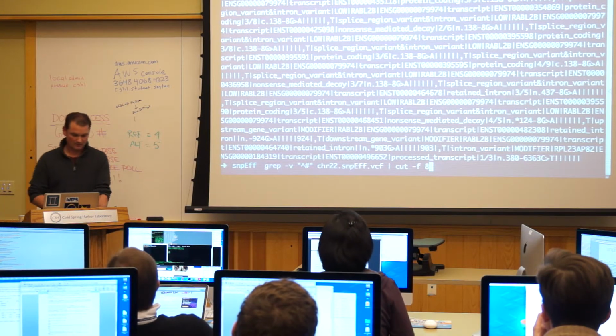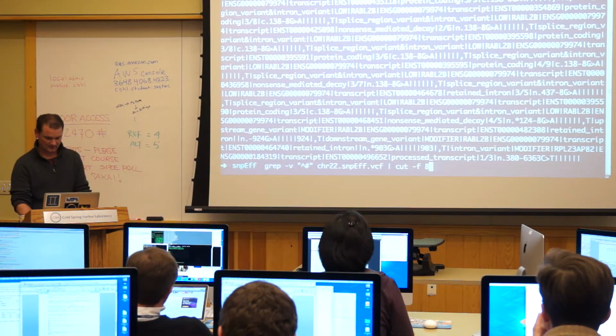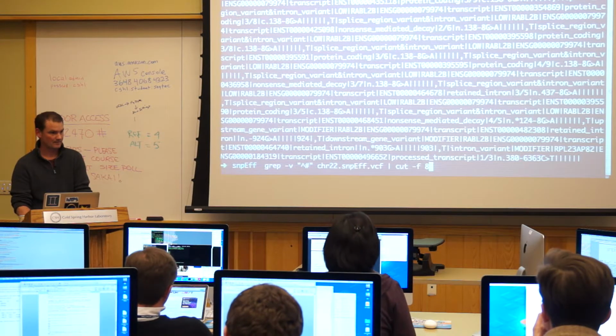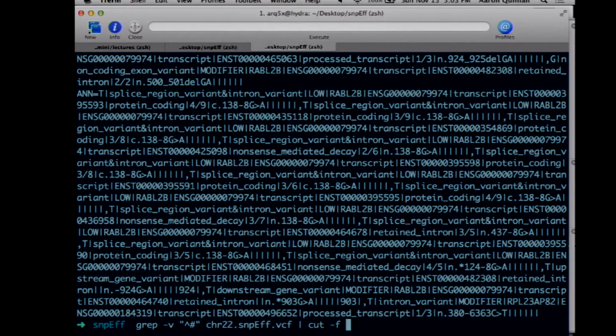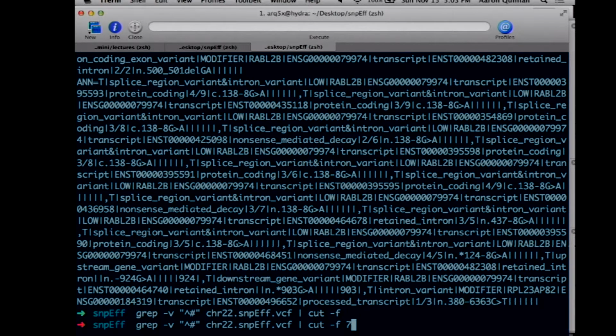Assuming that every other transcript just points back to the same gene, then just take the first gene you see. Can you do that? I think that'll work too, but let me show you what my idea is and we'll see. Well, I've got to cheat again. I just always forget the column numbers.